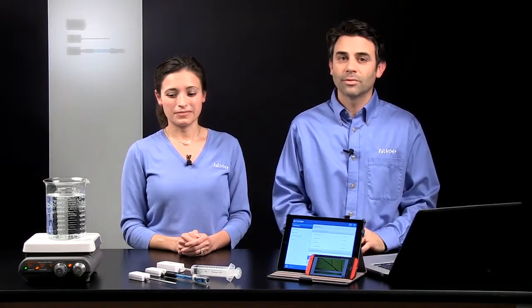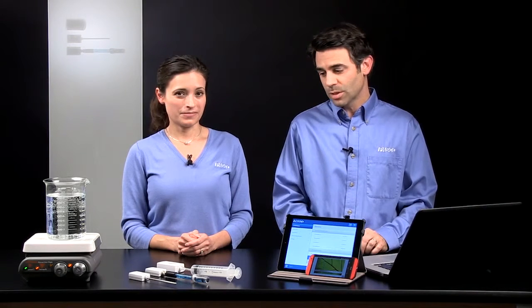How easy are they to connect, Tom? Well, let me tell you. All the wireless sensors are going to be using Bluetooth Low Energy to connect to your devices. Some of the wireless sensors, like the wireless pressure, will connect via Bluetooth Low Energy and via USB.